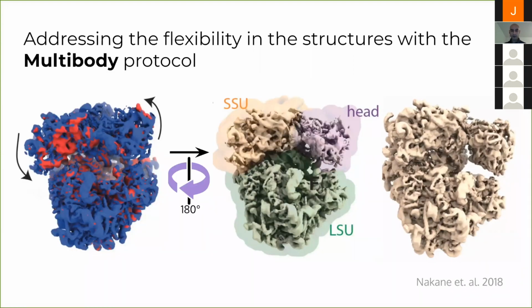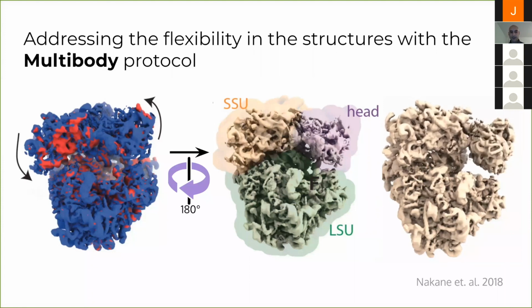Now there's been a lot of effort put into trying to push the resolution of these reconstructed models to higher and higher resolution by addressing some of the different issues. There are a lot of issues, and a lot of them are related to microscope physics. Some of them are related to computational issues, limitations in computational power, that were addressed by GPU acceleration, for instance.